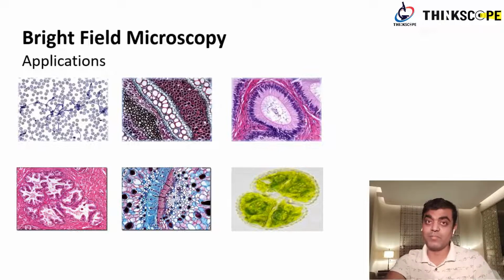So histopathology samples have tissue sections. In the tissue sections, they simply have to stain it and put it on a glass slide. Once they put it on a glass slide, you can see here the tissue morphology. You can see the cells which are normal, cells which are not normal in the types of morphology, in the types of distribution, in types of cell-cell interaction.